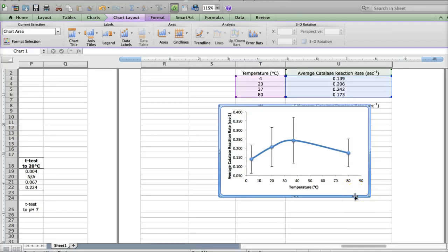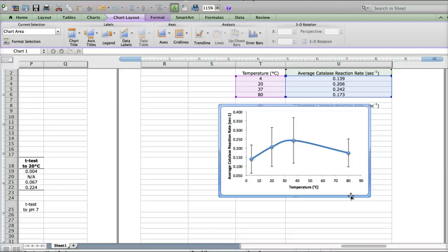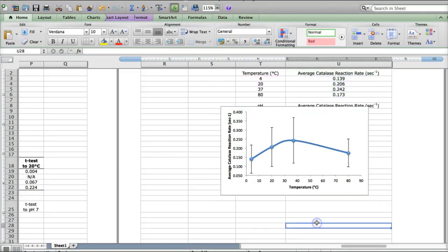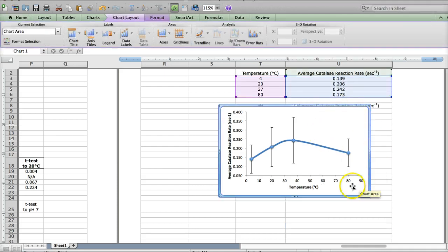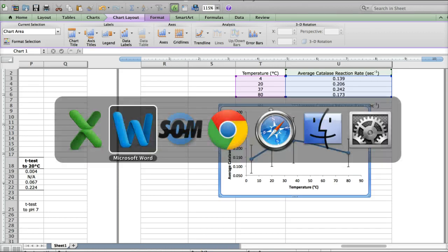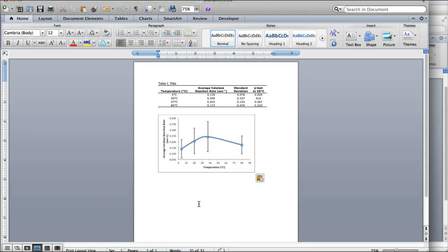All right, so at this point, this graph is definitely acceptable and will receive full credit. So you can copy and paste it into your Word file again. The way to do that is make sure that you've clicked the graph so that the border is highlighted there. And then you'll copy it. Go back to your Word file. And you're going to paste it into that Word file.